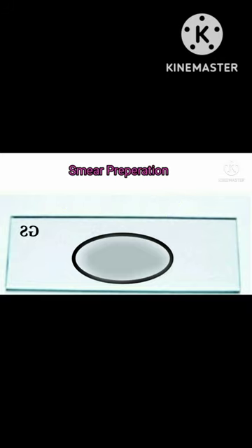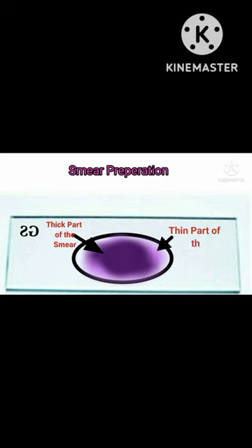Smear preparation is a very important step. One must make an even smear, otherwise alcohol will continue to wash the violet color from thick parts of the smear while thin parts are being over decolorized.